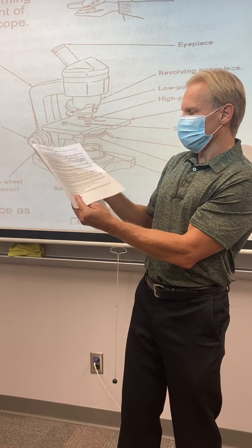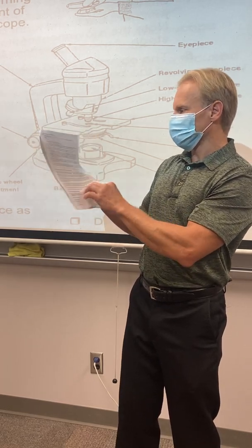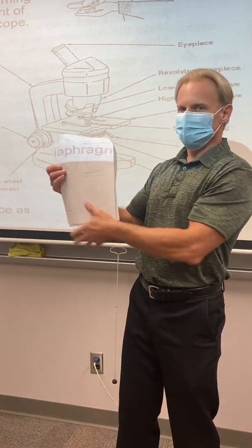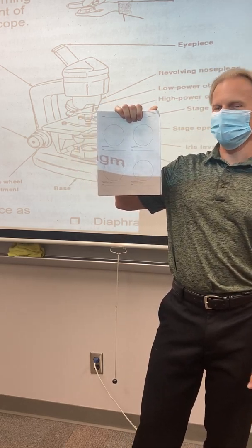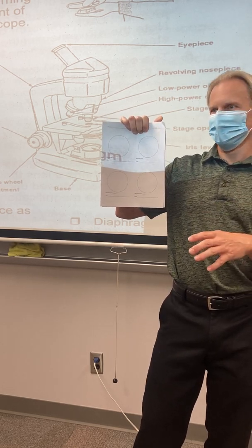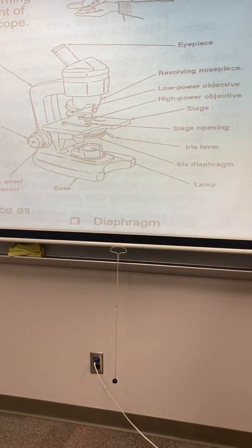See, on the back here is more about locating things. When we're totally done going through the overview of the microscope, you're going to be looking at some slides. And you'll have some choices. You can choose any four things that we have down there, and there's more than 4 slides out. All the slides are prepared for you. Later in class, we'll learn how to actually make a slide, so we're just going to use the prepared ones today. So let's go over some of the parts.